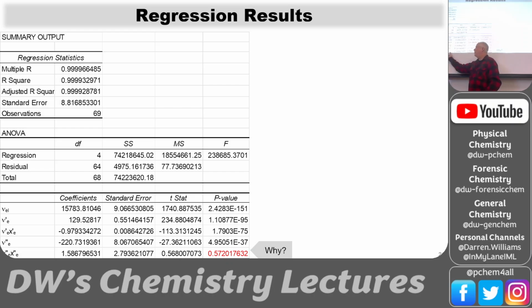You could also look at the error. What's your value? 1.5. What's your uncertainty? 2.8. Right? So that's a reflection of this uncertainty. We're not confident in that number at all. Okay. What does anharmonicity tell me? How unequal the levels are. And look at the excited electronic state. It's very well determined because we have so many measurements of the excited electronic state.